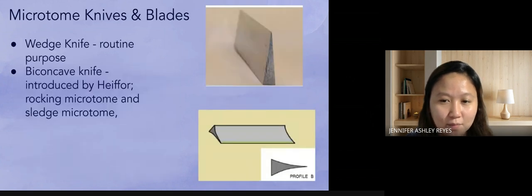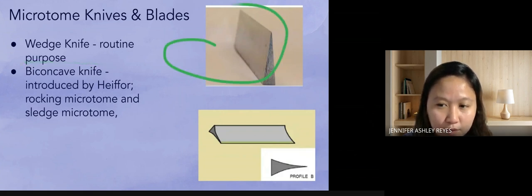So this is a wedge knife. It's for routine purposes.